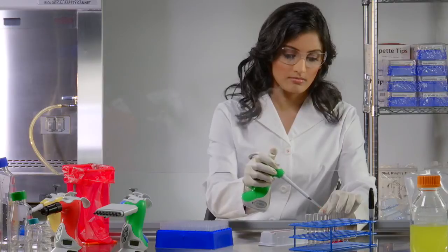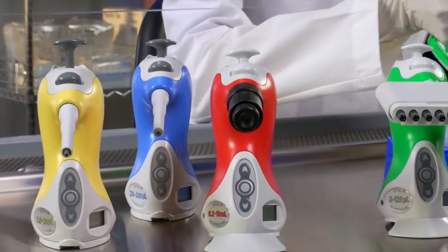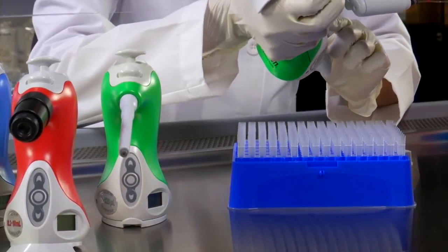Ovation's securely mounted tips are easily ejected. Our pipette stands alone — tips never touch the bench, reducing risk of contamination and allowing you to leave your work while attending to other needs in the lab.